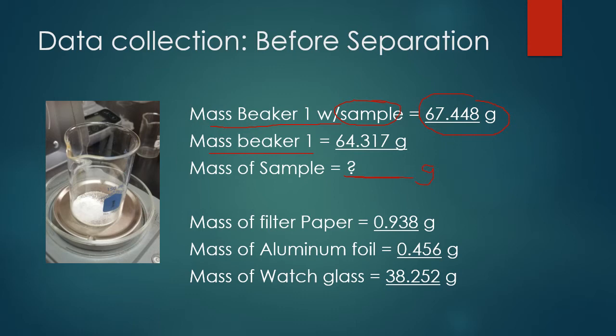Next, the filter paper is also massed at 0.938 grams, a piece of aluminum foil which we'll be using later in the experiment at 0.456 grams, and then a watch glass at 38.252 grams. Fill that data into your table for before separation as well.